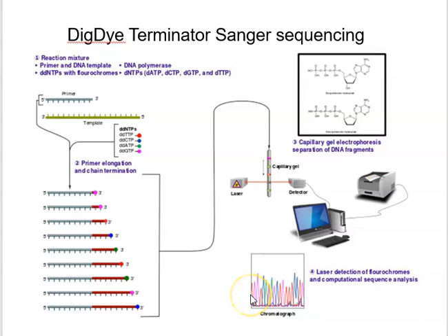So if these are the first ones to come out, and these are the last ones to come out, this is the start of the sequence, and we read the colours and convert that into DNA sequence. This is mostly what was done up through the 70s and 80s, the Sanger sequencing. I was doing that in the 90s. Then the BigDye Terminator through year 2000 onwards, and then we started doing whole genome sequencing using one of two technologies. I'm going to teach you about the Illumina platform.